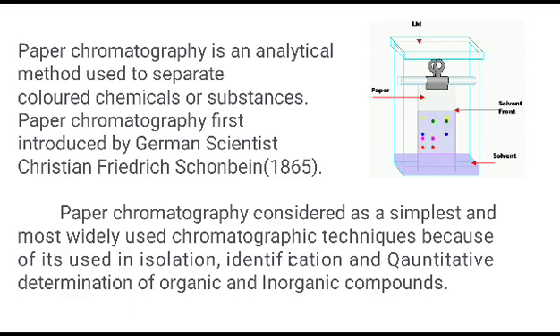It was first introduced by the German scientist Christian Friedrich Schönbein in 1865. Paper chromatography is the simplest and most widely used chromatographic technique because it is used in isolation, identification, and quantitative determination of organic and inorganic compounds.